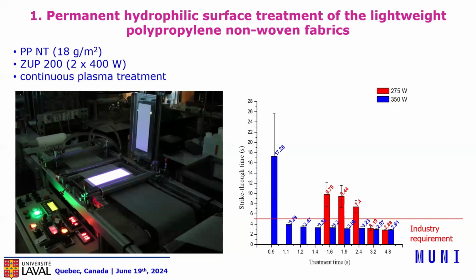We can 3D scan your sample, and scanning electron microscopy is like this, and we can create such a polarity. Their question is, okay, and what is the strike-through time? Because this is what is interesting for us.